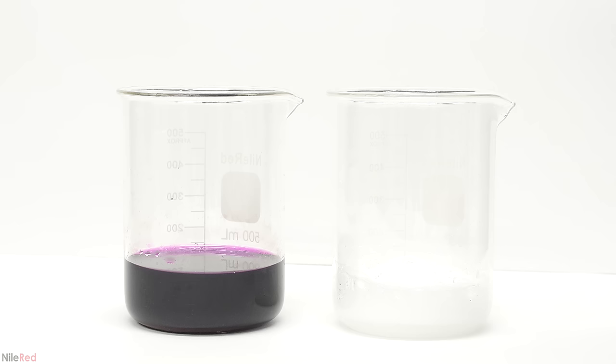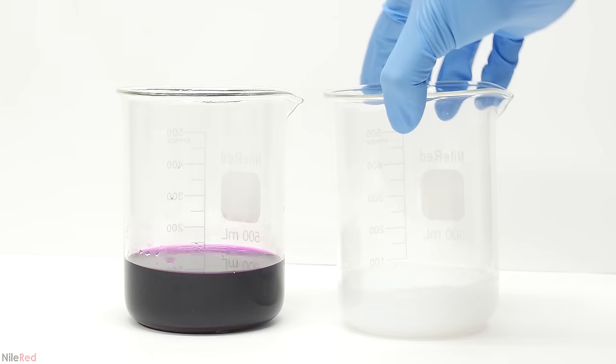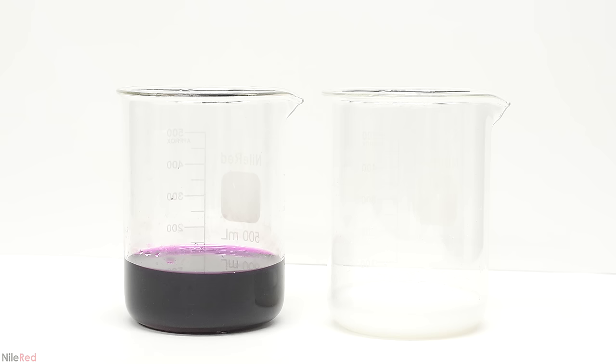These two solutions are the easiest to deal with, so I decided to do them first. The nitric acid in the beaker on the right is neutralized using a little bit of sodium bicarbonate. There's no need to measure anything out — I just keep adding sodium bicarb until it stops bubbling.